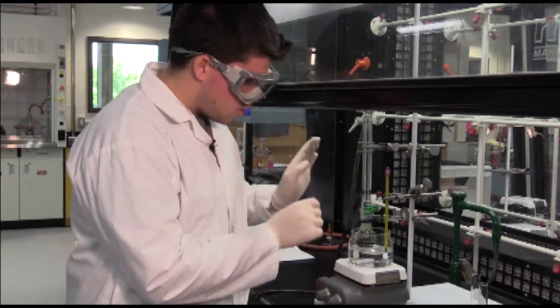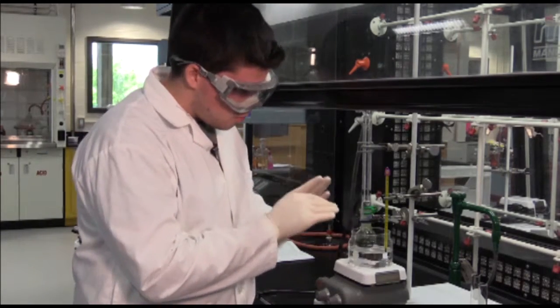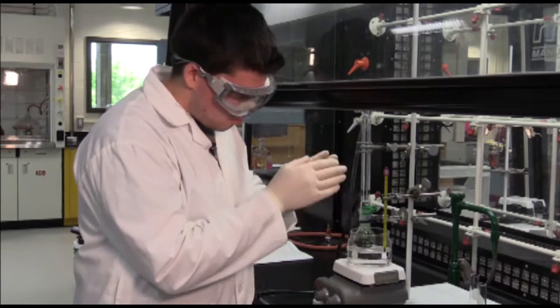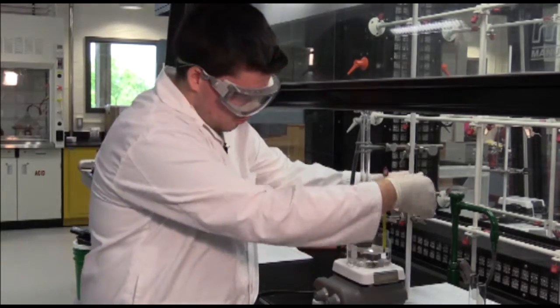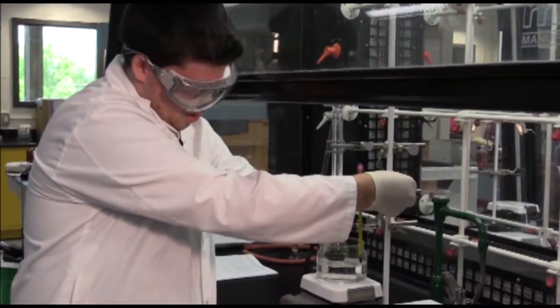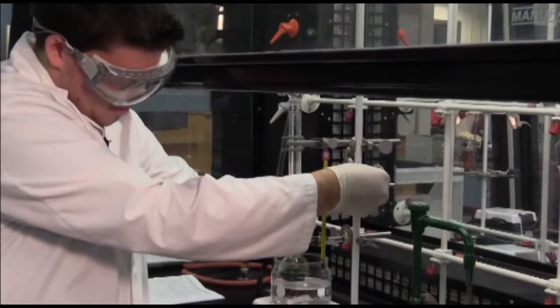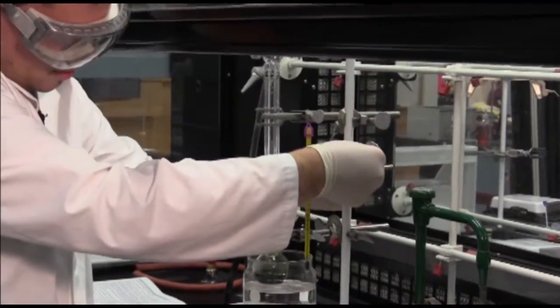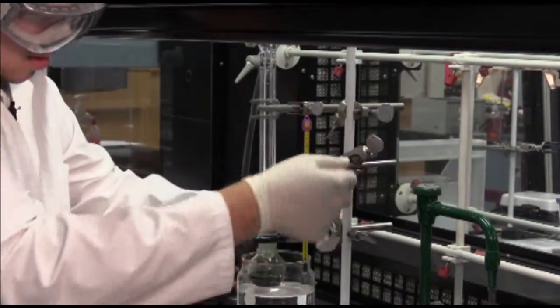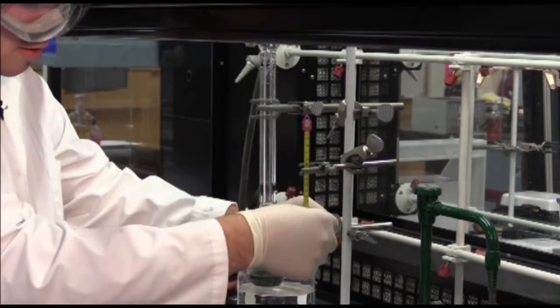Once your heat is off, you can now raise your round bottom flask, condenser, and thermometer up. So first we'll raise our thermometer up out of the oil bath, then next we'll raise our condenser up.